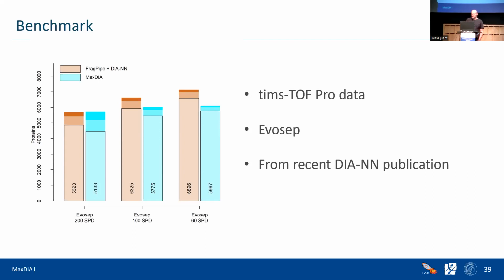So these are protein groups, right? I think looking at proteins instead is not really a good idea, because you're just getting the redundancy from the sequence database in. That's why we always make comparisons on protein groups and not on proteins. So I would not recommend doing this with proteins, because then you get a lot of arbitrariness into these comparisons, and I think that's not the way to do it, unless you have a very specific way of doing it in mind. Okay, thank you.